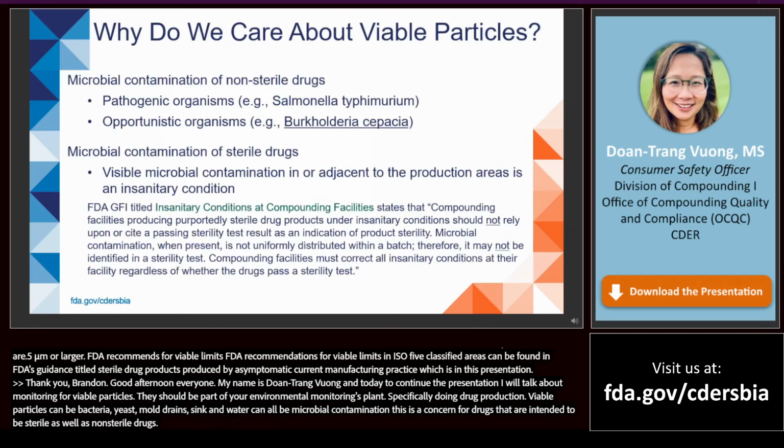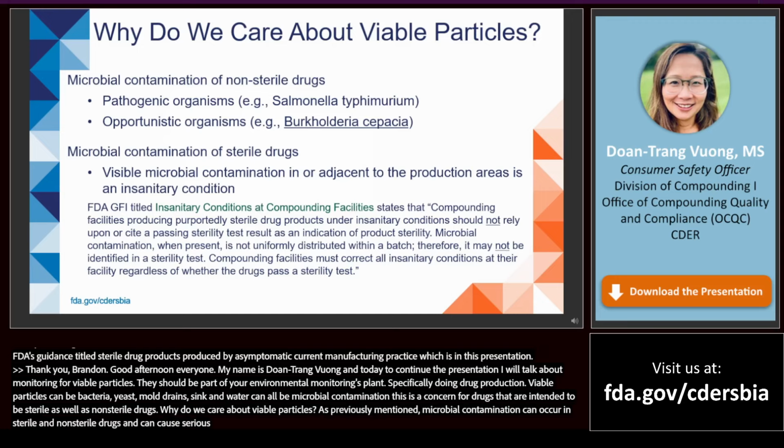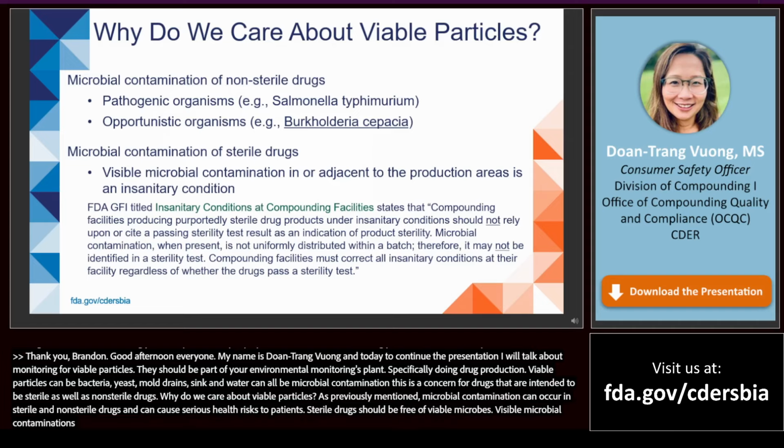Why do we care about viable particles? As previously mentioned, microbial contamination can occur in both non-sterile and sterile drugs, and they can cause serious health risks to patients. Sterile drugs should be free of viable microbes. Visible microbial contamination in or adjacent to the production area is an unsanitary condition.